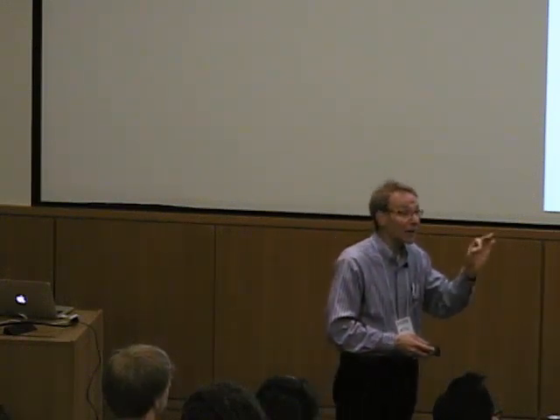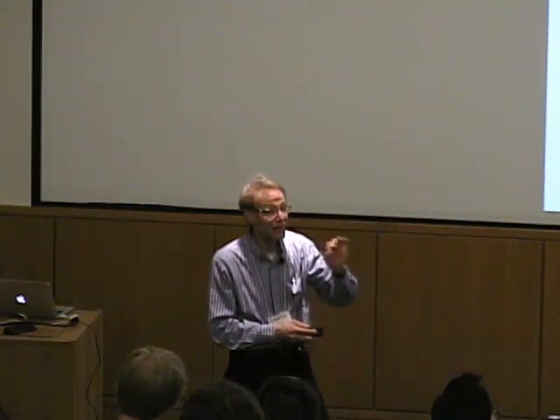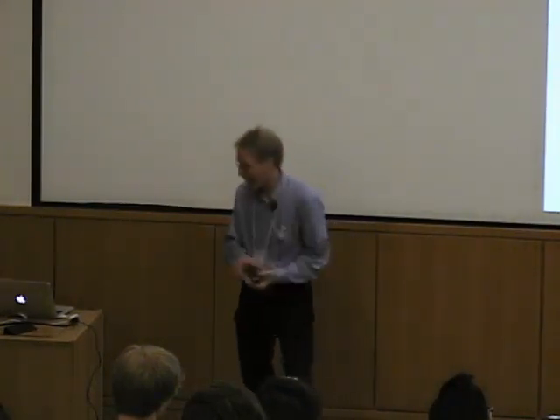So the question here is, for the metal ion binding in 2 different oxidation states to the same coordination site imposed by the protein, what are the thermodynamics? How is it similar? How is it different? This is the question we want to ask.